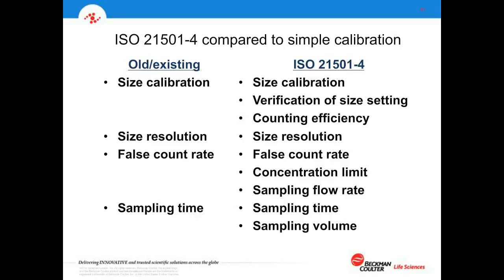However, in some industries, many of the life science, the biopharmaceutical industries, they look to do this every 6 months because, again, their sense of risk is different than other industries. You may have a high sense of risk, and you want to know your measuring instrument is always known to be in operation correctly through calibration.